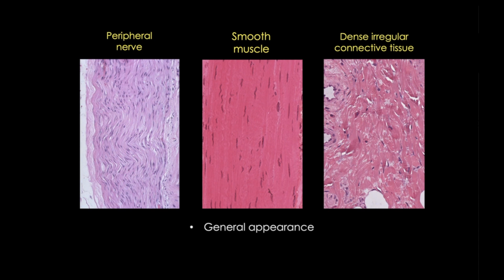Number one is the general appearance of the tissue fibers. Number two, the location and number of nuclei. And number three, color. Color is not something that I will generally tell my students to use as a distinguishing feature, but in this case color — or maybe intensity — can be helpful.